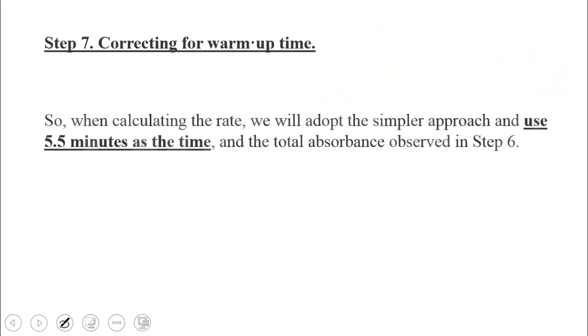Now, in your calculations, after you have found the concentration of salicylic acid, we need to correct for warm-up time, because when we put the test tube into the water bath, the temperature of the water bath drops a little bit and then comes back up to the 80 degrees.